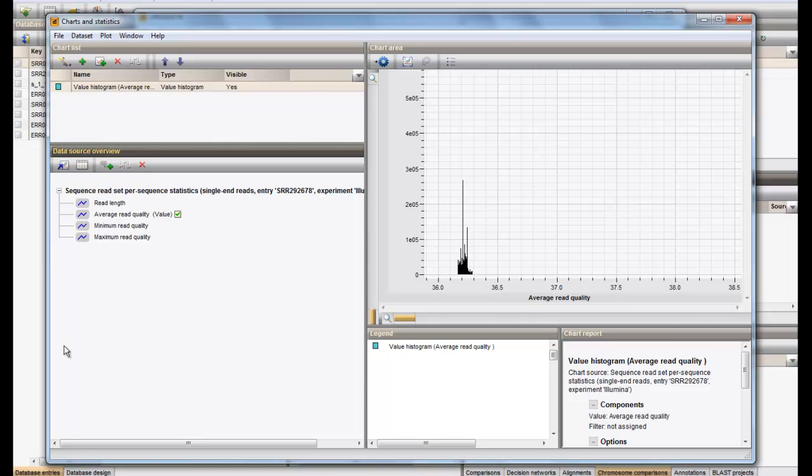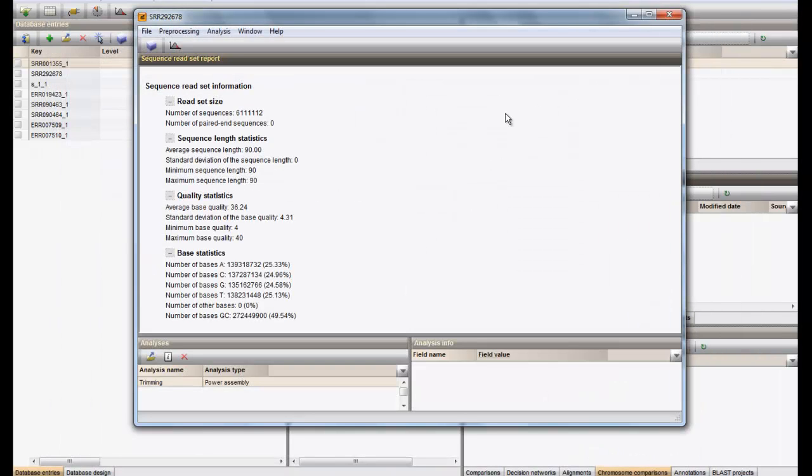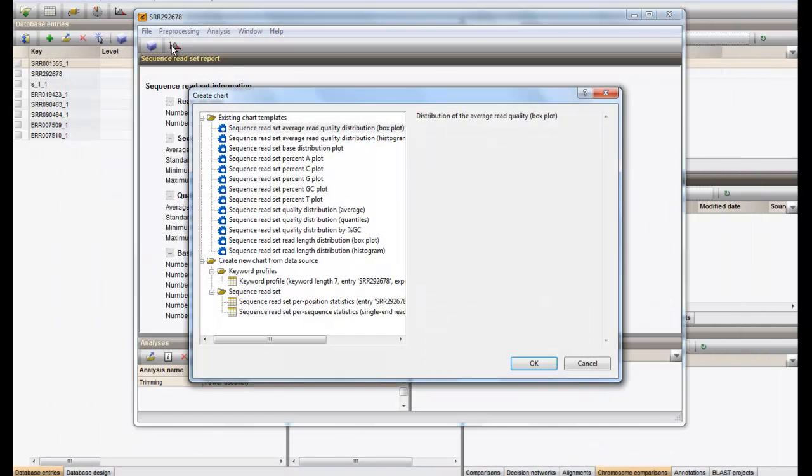We can close this chart and try another template. We can now select the read set base distribution plot.